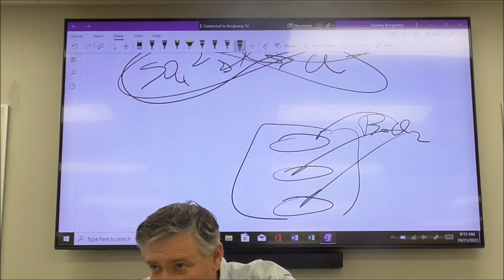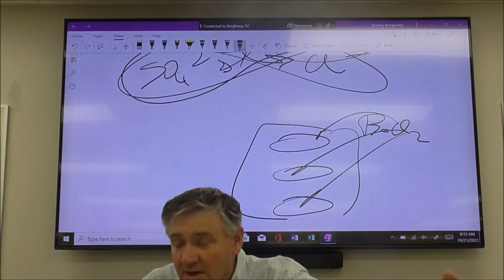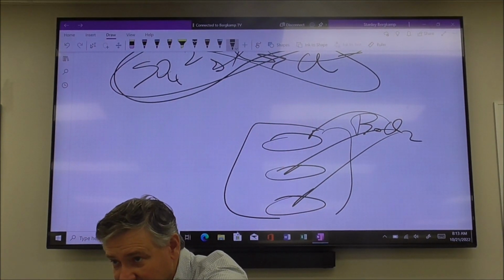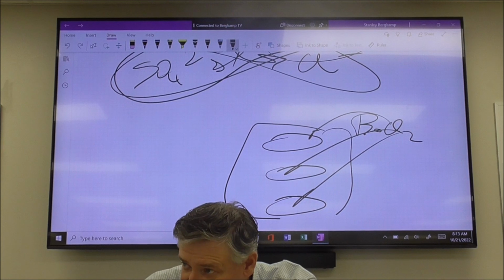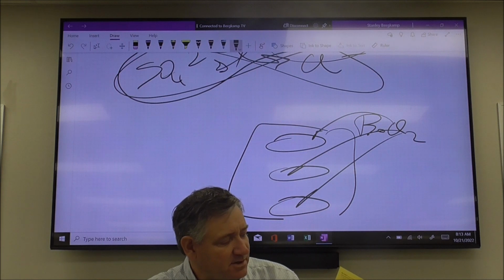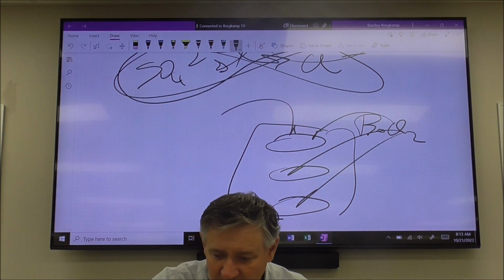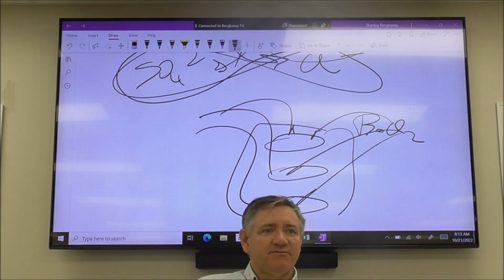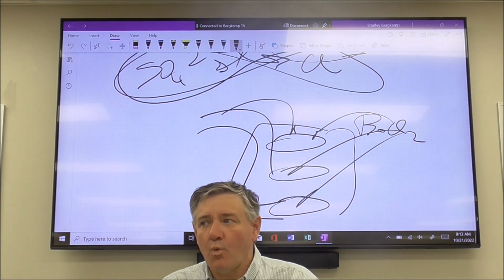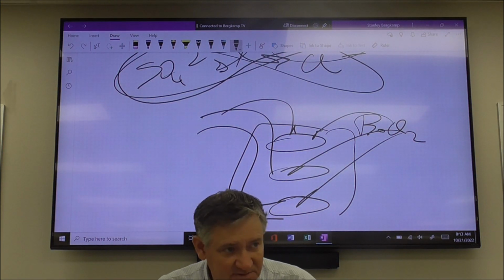She's not going to tell Luke what it is. This is the whole point. She then gives that well plate back to Luke. Luke then is going to add sodium carbonate, sodium sulfate, and potassium iodate. He's going to add those 3 to them, and then he's going to make that observation, what happened. Then he's going to go back to his data table and go, wow, which of those 4 matches this? That's what's going to happen.